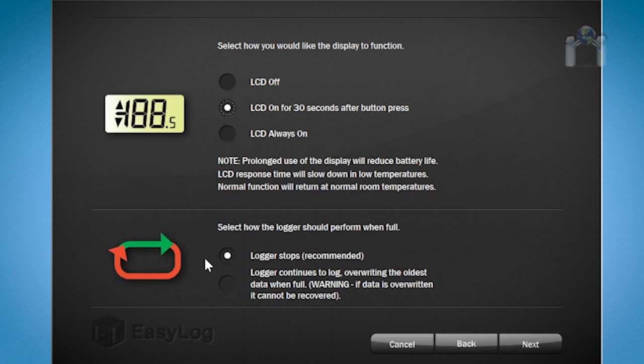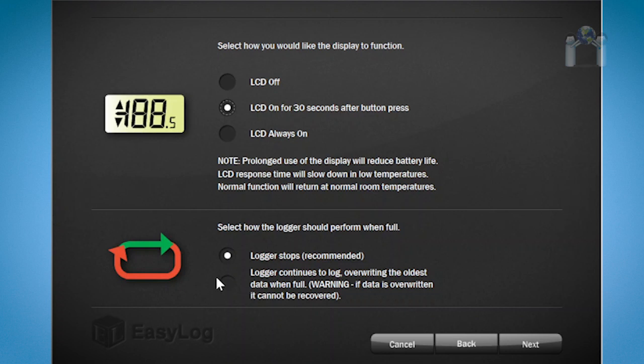Below the LCD configuration are options for what the data logger should do when the memory is full. Logger will stop, which is what is recommended, or the logger will continue to log but it will begin to overwrite the oldest data, which cannot be recovered. I'm going to keep the default option to stop the logger.